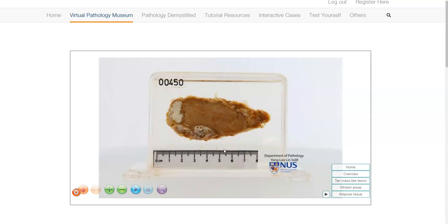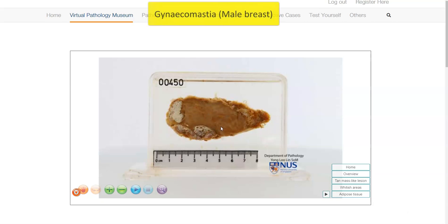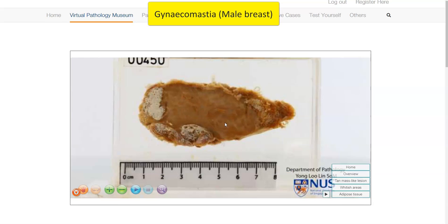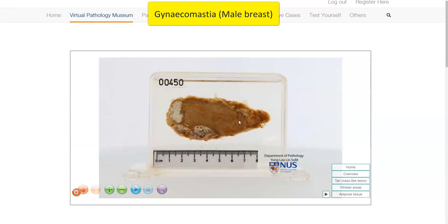Hello, this is a virtual pathology specimen of a case of gynecomastia, which is a benign lesion involving the male breast. So we see here a nodule that has been excised, and we are looking at the cut surface.